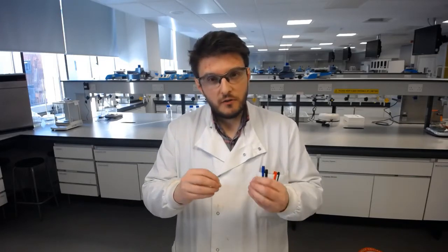So we need to think about ways that we can actually keep the drug particles in suspension for longer. One of the chief ways of doing that is to make sure that the particles are very small so that the rate at which they fall through the water is quite slow. One of the other ways that we do this is by putting in wetting agents, which typically may be a surfactant, but might also be something such as a clay mineral. What that does is it surrounds the particle and helps to keep it in suspension by having soluble parts that would like to go into solution.